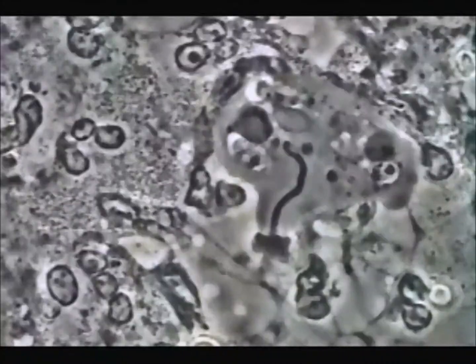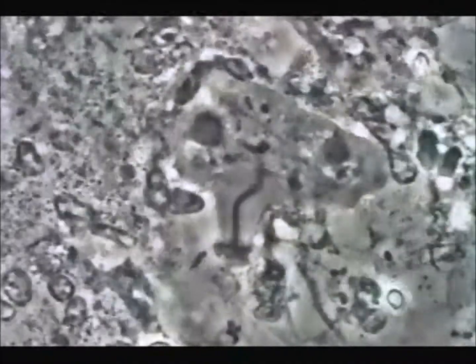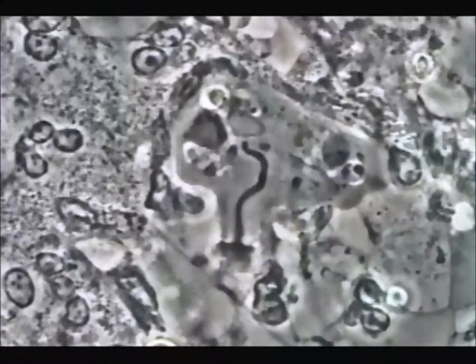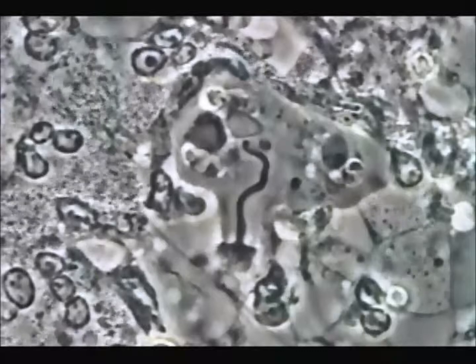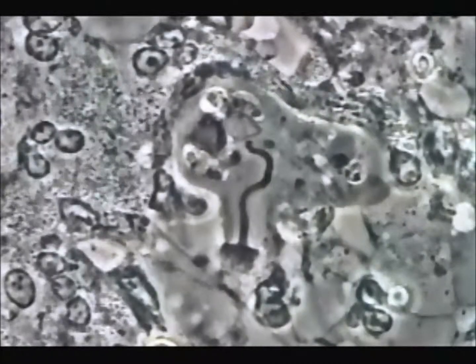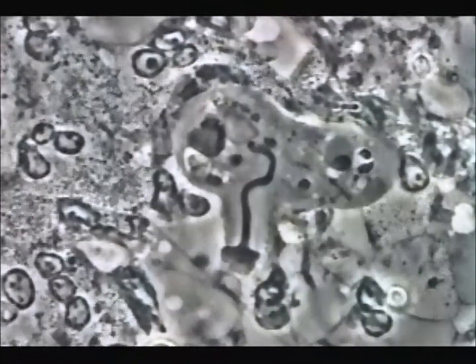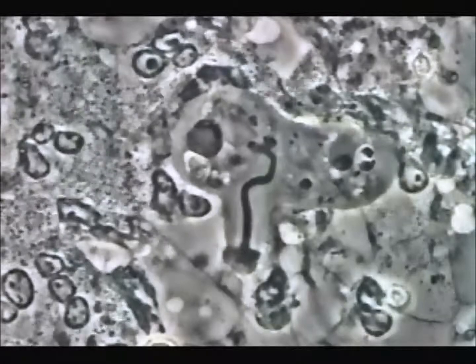We see what we were expecting: all those PMN polymorphonuclear neutrophils granulocytes, and in the middle you have the typical amoeba that you can find in almost all periodontal disease in activity. You see first the white cells surrounding the amoeba.